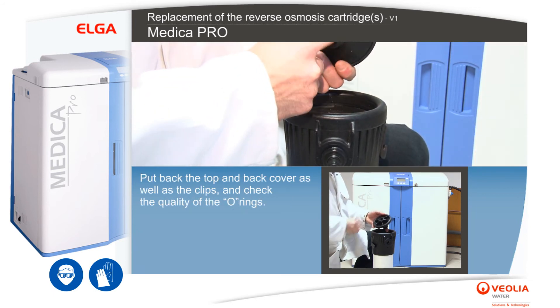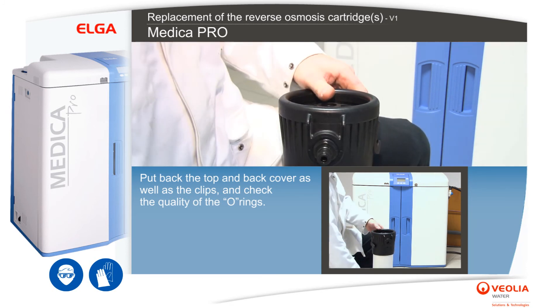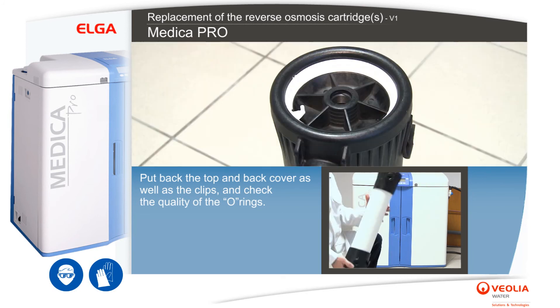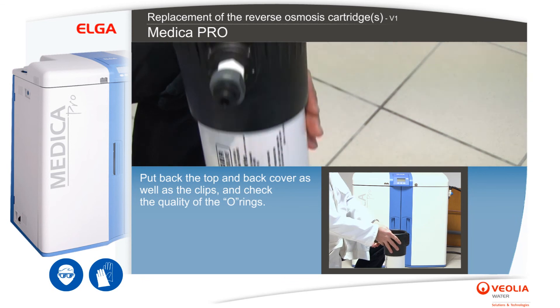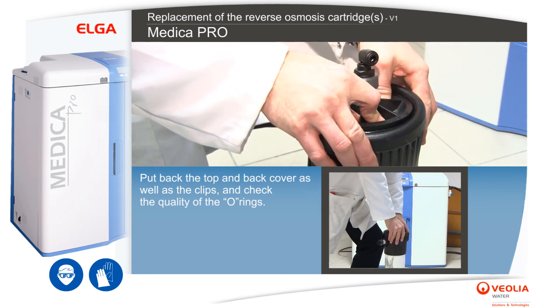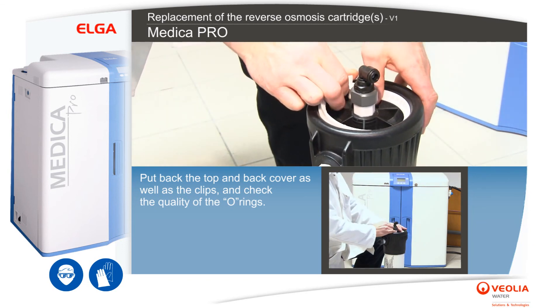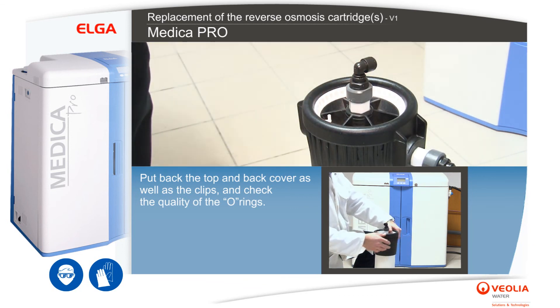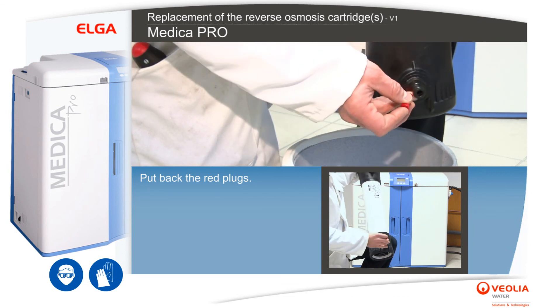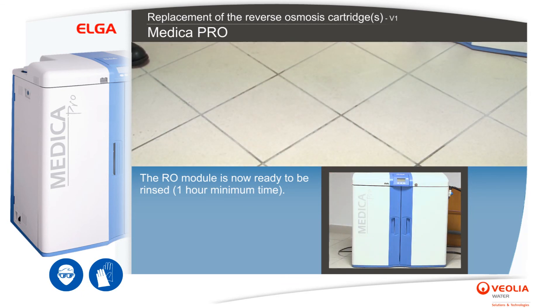Put back the top and back cover as well as the clips and check the quality of the o-rings. Put back the red plugs. The RO module is now ready to be rinsed — minimum one hour.